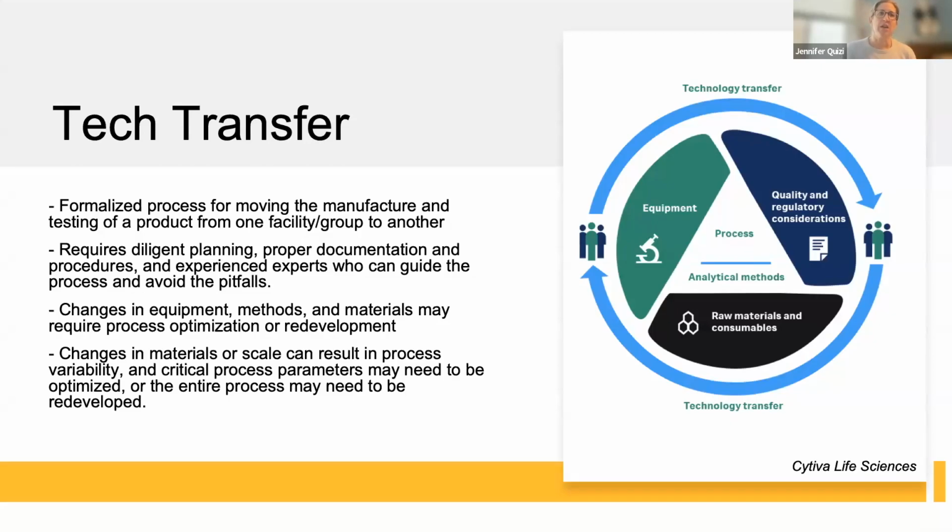So oftentimes, you think you could substitute something out in the downstream or in the upstream, and then people are shocked that when we get down to the purification side of things, oh my goodness, we all of a sudden are losing all of our product at whatever step, maybe tangential flow filtration. So this is, again, where during the technology transfer, we want to make sure that we're taking a very methodical approach. One, using all the information that you've provided us, leveraging that and existing processes to test the feasibility of your product in an existing system. And then more importantly, moving forward in terms of, okay, now what do we do next?